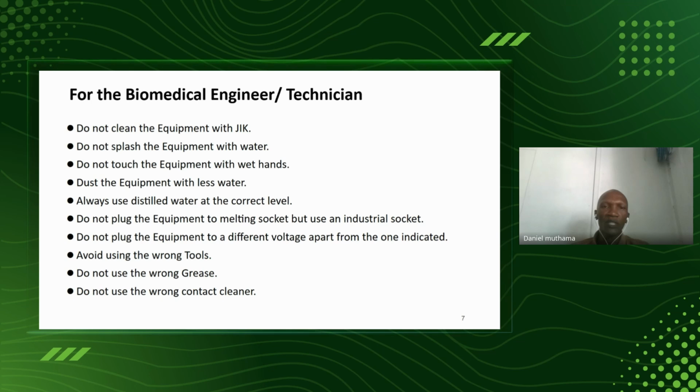Always use distilled water and at the correct level. This is very important because if you use any different, there will be formation of scaling within the electric heating element, the immersion type. So when you use distilled water, the deposits will be minimized. The scaling will be minimized.